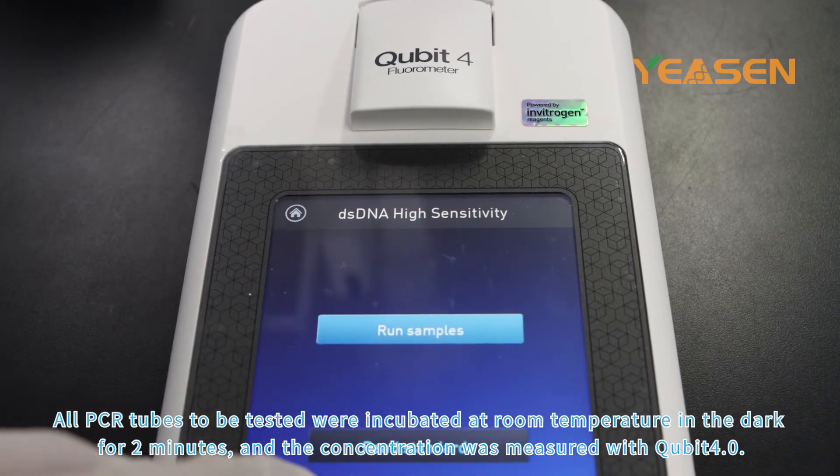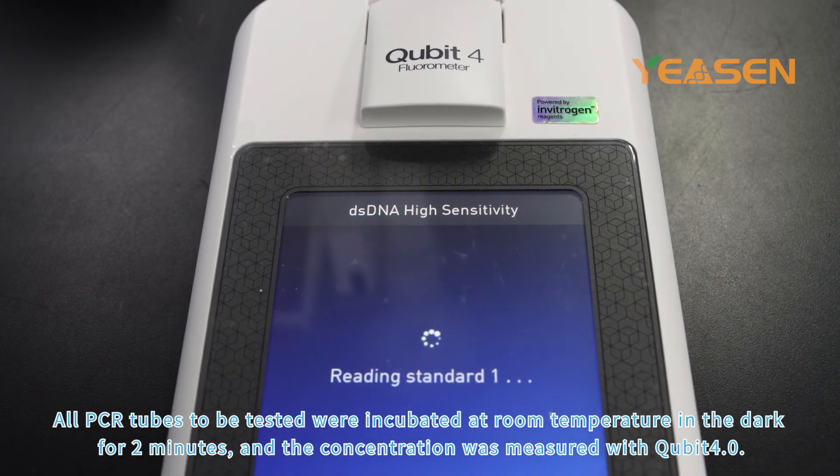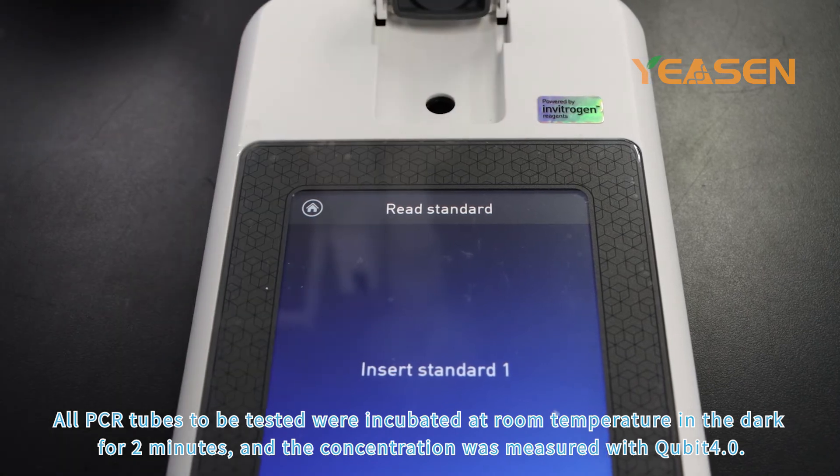PCR tubes to be tested were incubated at room temperature in the dark for 2 minutes, and the concentration was measured with Qubit 4.0.